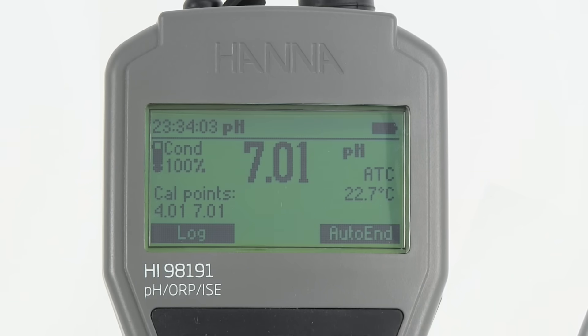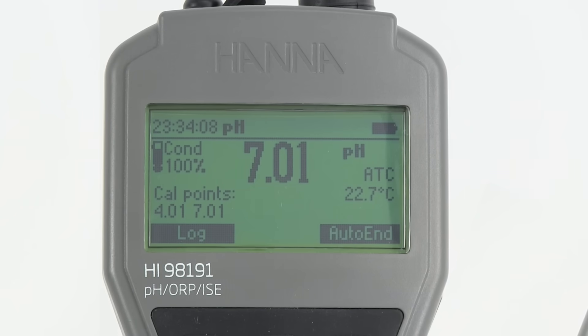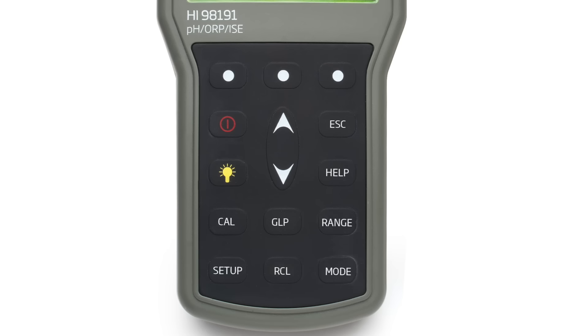To switch between pH, millivolt, and ISE mode, simply press the range button while in measurement mode. Both meters can store 100 measurement readings for each measurement mode. A reading can be logged by pressing the virtual log key, and stored data is easily recalled by pressing the RCL button.